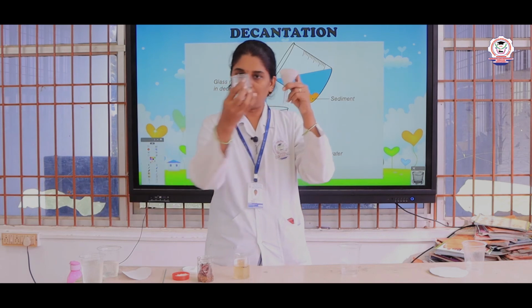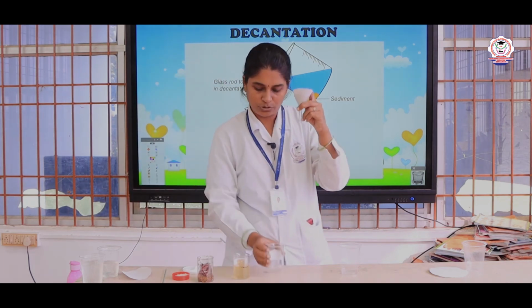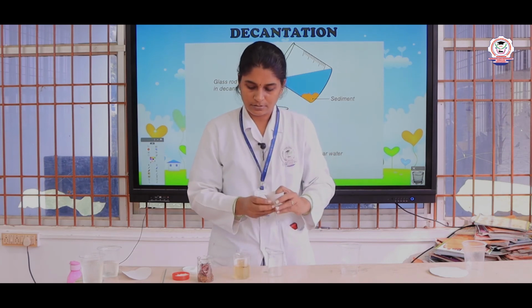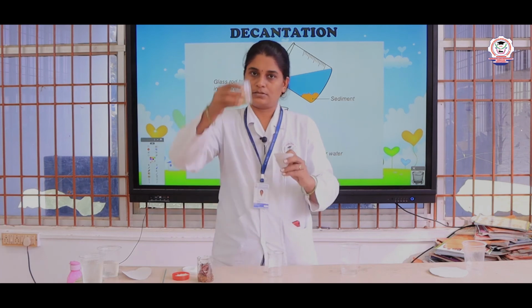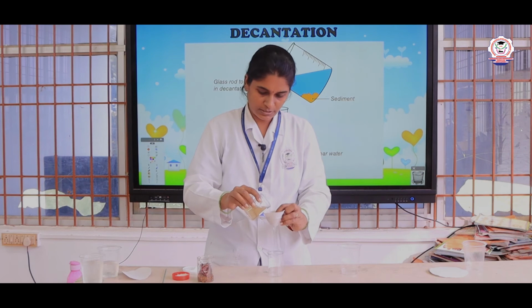I have a beaker without water. Let us separate this impure water. Now I am pouring this water.